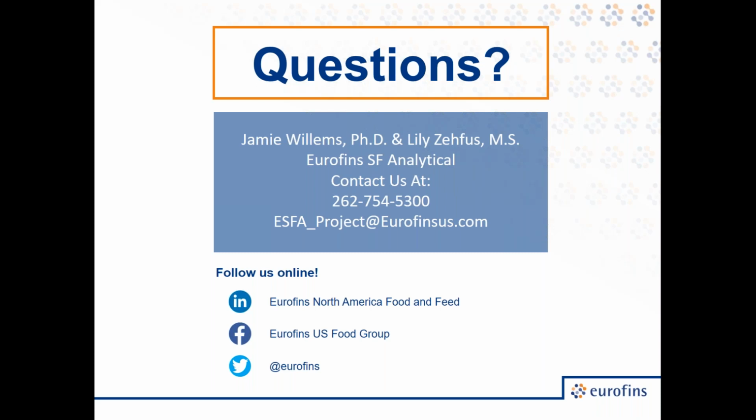For example, going back to our fruity beverage, seeing something like isopropyl alcohol was not something we would expect to find. And then in addition, we look at how significant is the difference. So if we have a very large peak that is only in one sample, that is likely to be significant. And then we also look at, is this compound actually likely to impact flavor and odor? So we have to consider how these differences could actually be linked to an underlying cause.